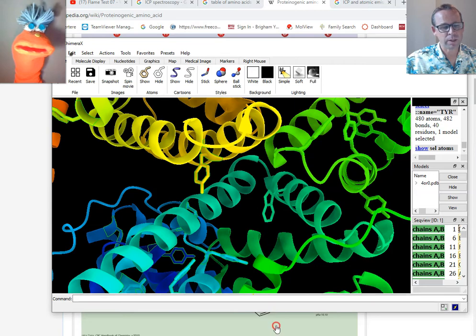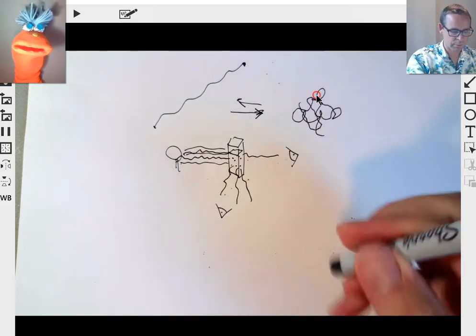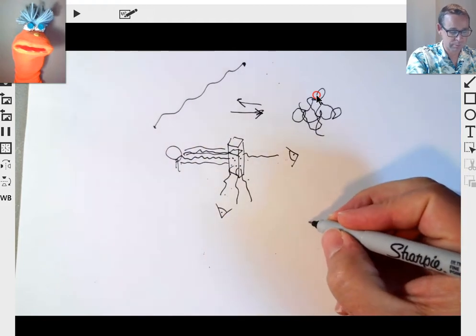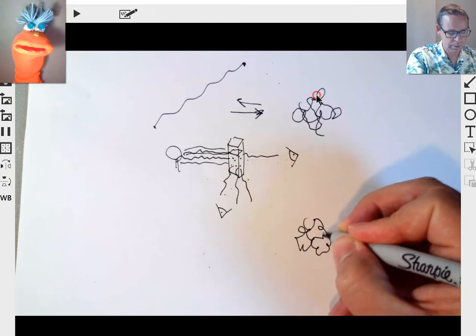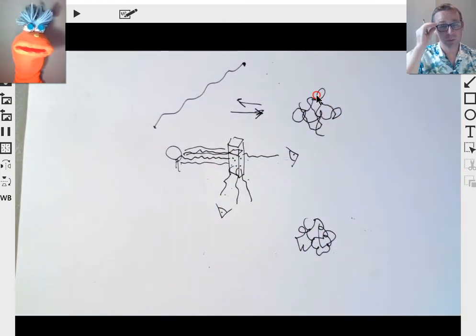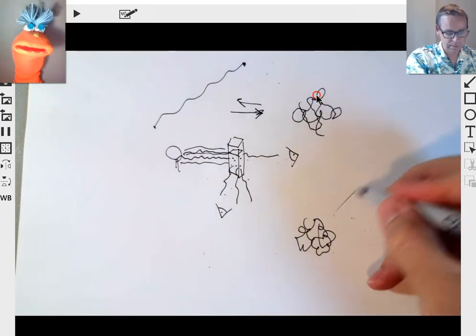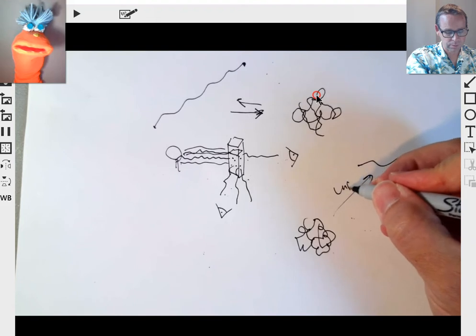Proteins don't always unfold so neatly, kind of like I'm showing here, all right? Sometimes protein folding and unfolding, or specifically unfolding. So here I have a simple protein that I've drawn, and we'll say that's folded. Well, when we unfold it, we'd like to think it forms a nice straight chain when it's unfolded.